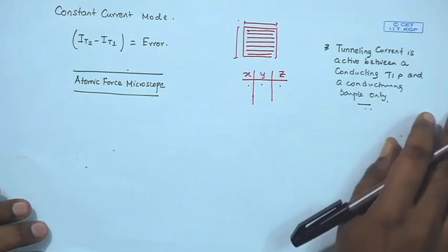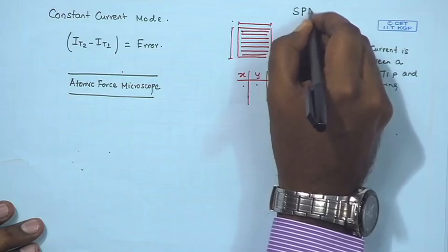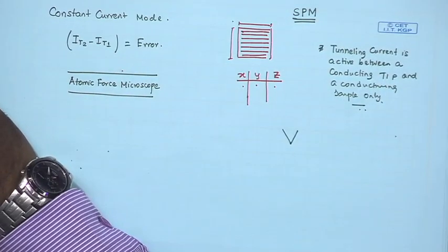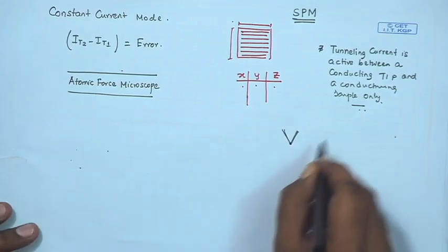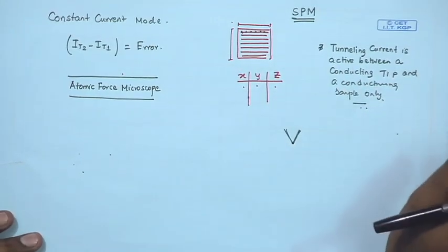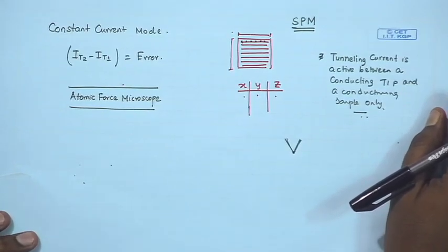But if you wanted to use this type of technique, a scanning probe technique, so we already understand why we use the term SPM. You have a probe, which in case of the STM is in fact the tip, and it scans, it goes from point to point to gather information about that particular point. In the simplest form, it gathers the information in the constant height mode, what is the variation in the tunneling current. In the constant current mode, you have a feedback loop, and therefore, it goes up and down.